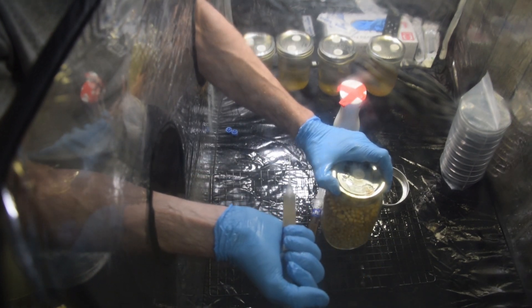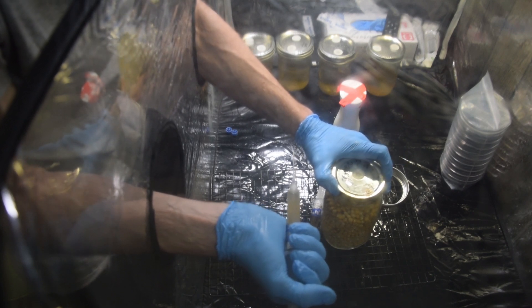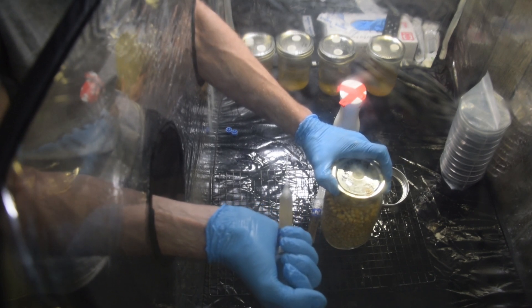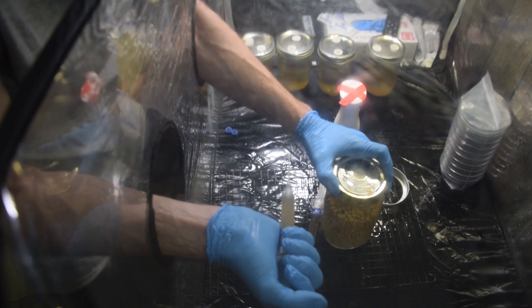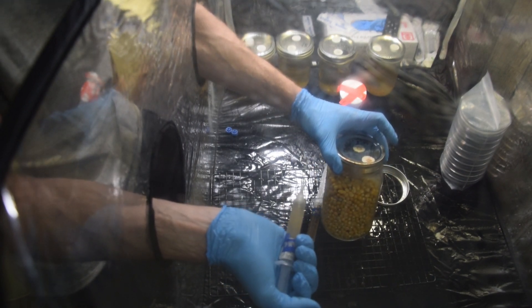The more you use, the quicker it's going to expand, but you also have to be aware that the more you use, the more at risk you are of wet rot and of just rotting out your popcorn. So when it's too wet, there's too much moisture.